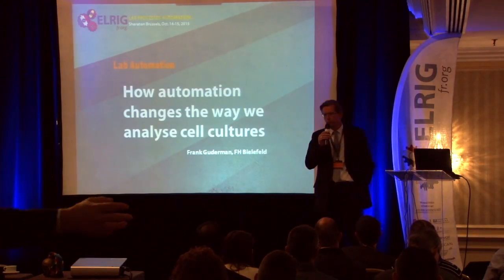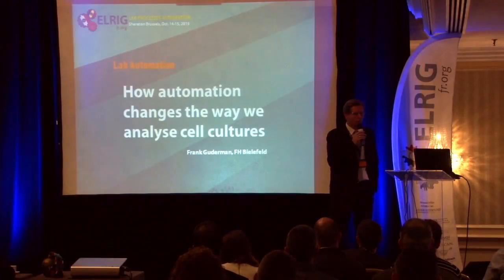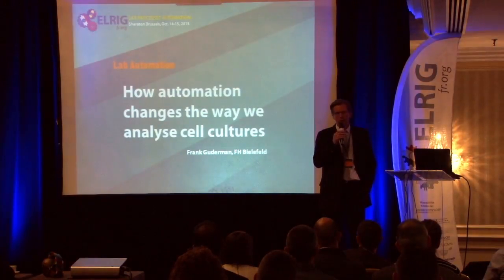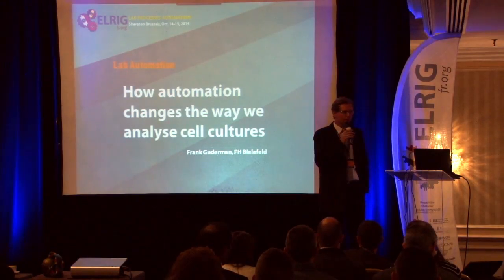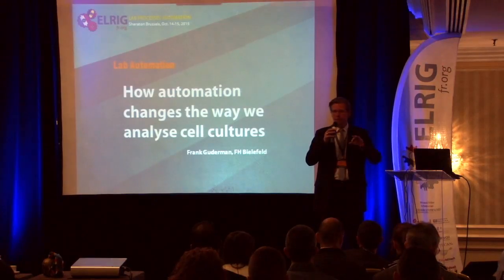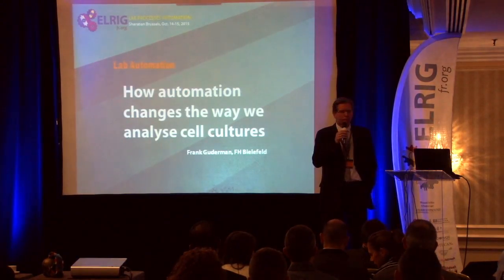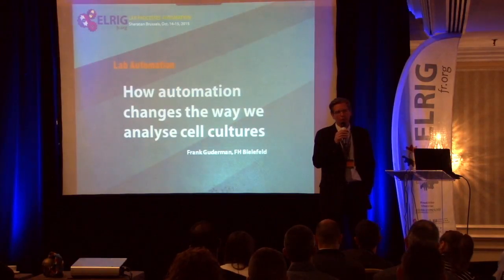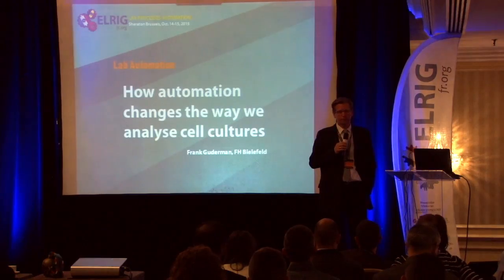I would think the robot needs 5 times longer than a human being, or even more. The only benefit is that it is able to work 24 hours in the lab. And as you mentioned, it's 8 years ago, so the robots look different now. There are 2-armed robots now that can take pipettes and whatever. So I think time is now ready for such a product, because everything is faster and quicker.